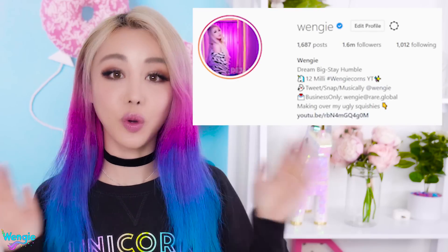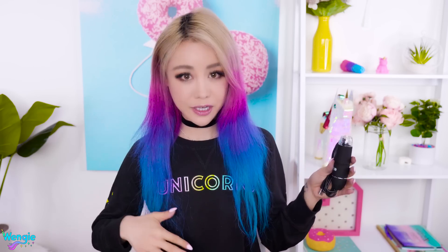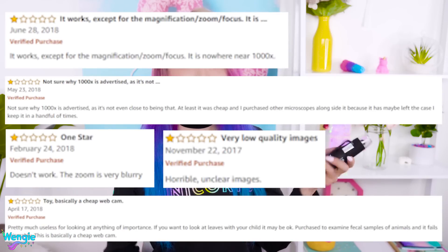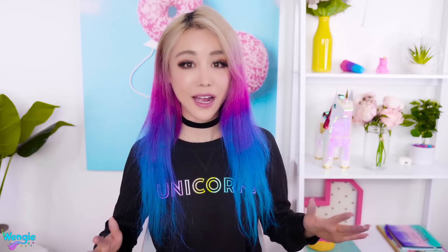So I went on Instagram and asked you guys what you want me to see under a microscope, and of course you guys said slime. So I found the cheapest 1,000 times microscope I could find and bought it. I looked through it and got images like this — but actual 1,000x magnification images should look like this. I checked the Amazon reviews and people were saying this was probably only a 50 times zoom microscope. I feel cheated, I feel click-baited. So I bought an actual scientific microscope.